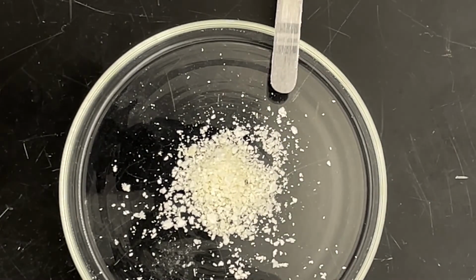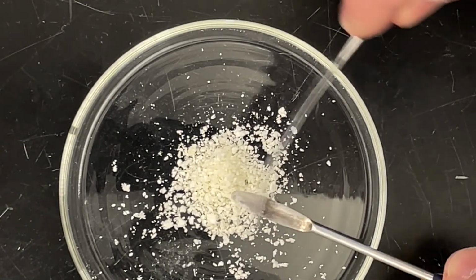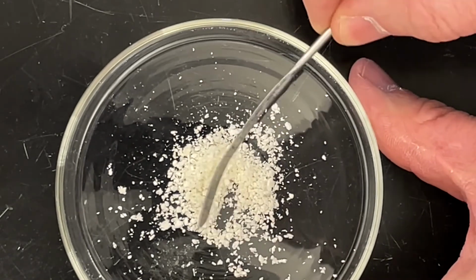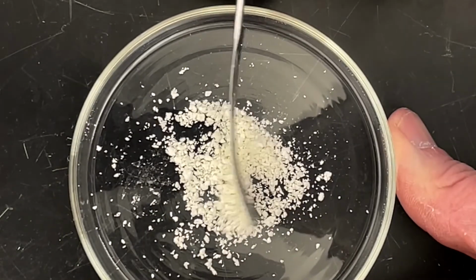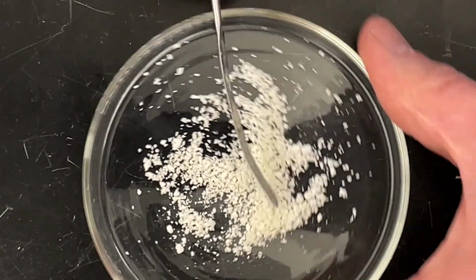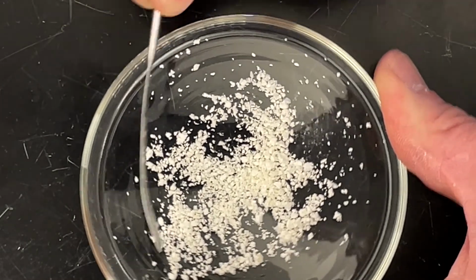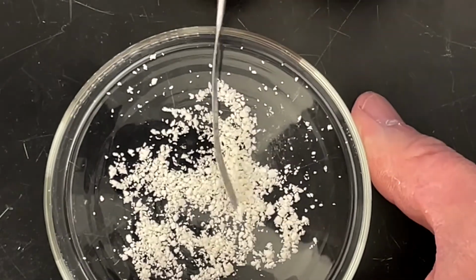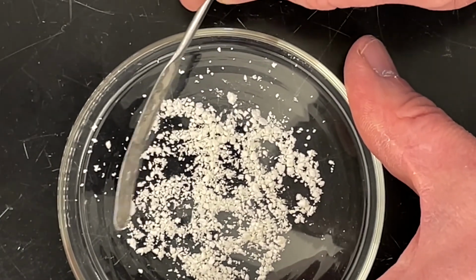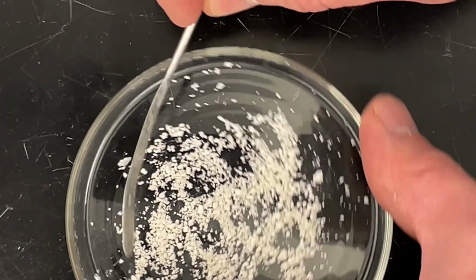Set that aside. And then, as always, we just place our spatulas and let's take this and give it some more surface area. Any of the big chunks, try to get them broken up a little bit. And we know this is going to weigh heavy, like I said. Let's go weigh it, see what we've got. We'll let it sit. We'll come back, we'll get another weight, and then we'll do a recrystallization.